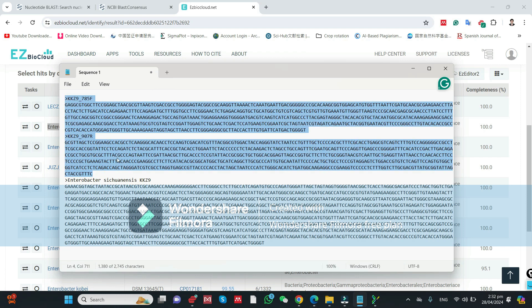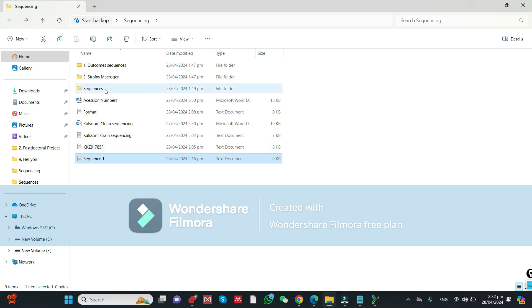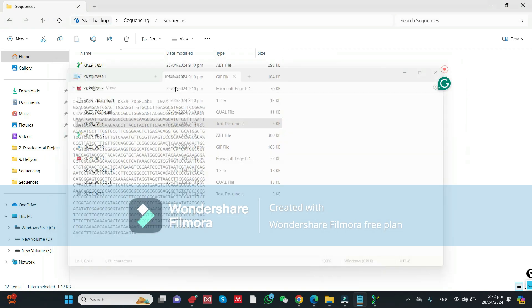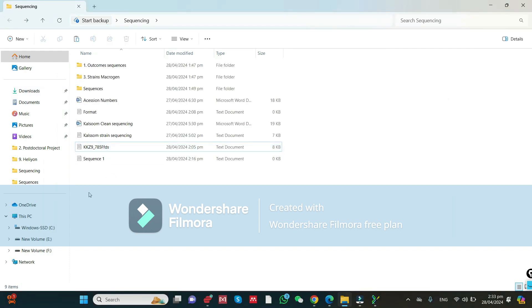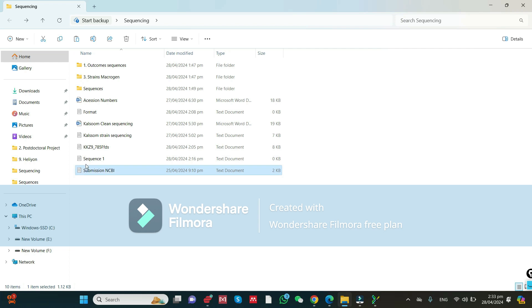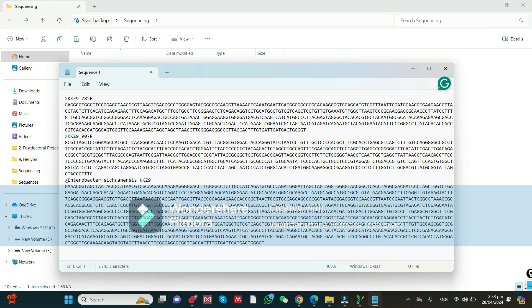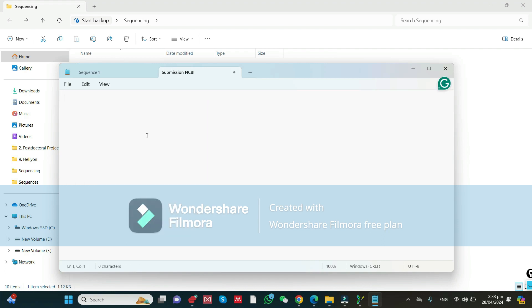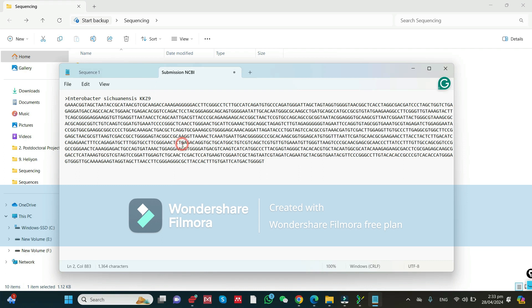This tutorial shows how to submit a sequence to the NCBI GenBank. You need a FASTA file format. If you have a sequence obtained from a company, you can copy the FASTA file. Paste it here and write the submission NCBI file, copying your desired sequence which you want to submit. Go and click on submission, select all and delete, then replace it with your sequence. Press Ctrl+S to save your file, then close it.